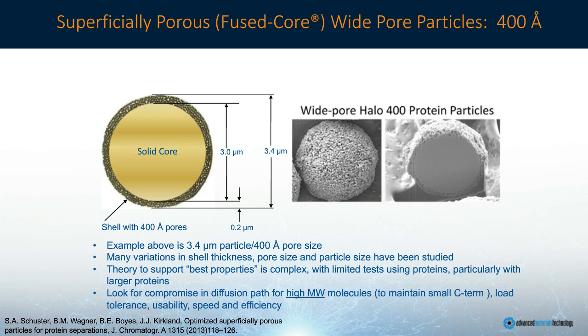Many variations of this particle had been gone through in the development process to try to get the optimal separation performance for these proteins. The idea of going to the larger pore is essentially where we're headed to do these larger biomolecule separations.